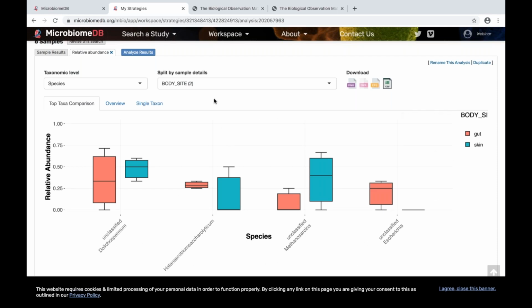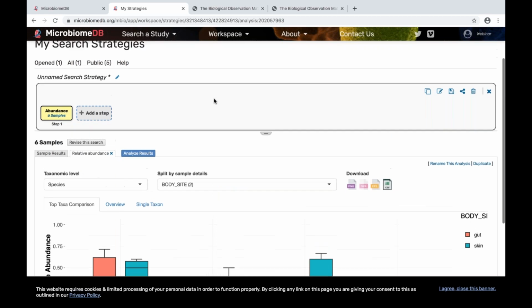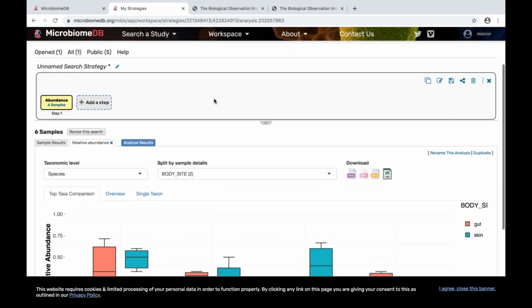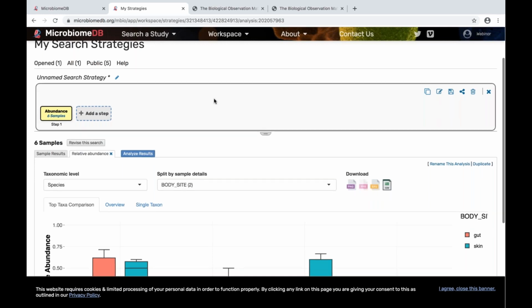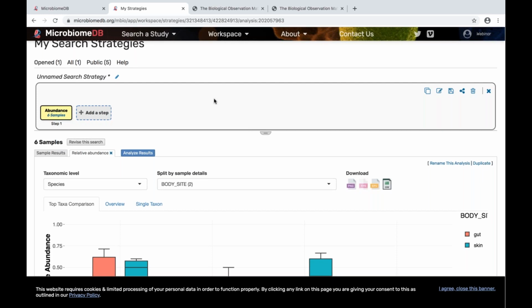Because the site is quite flexible, you can do a lot. And we have actually just started discovering what else, apart from the original use case, you can still do. For example, using the strategy panel, I'm just going to show this.